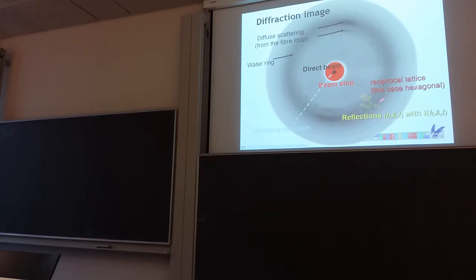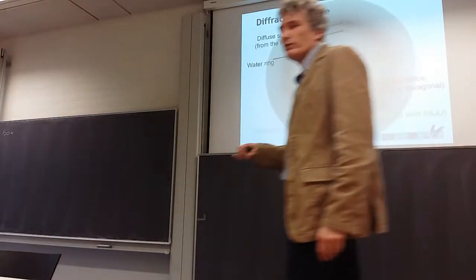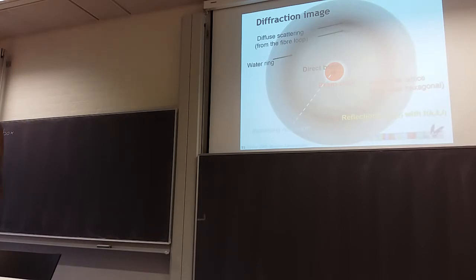That's why you need 3 indices. And for each index point, you have an intensity, which can be 0 if there's no spot, or a higher number if there's a spot. Okay. So now, how does this diffraction work? Why is there any information about atomic locations in this pattern of points?